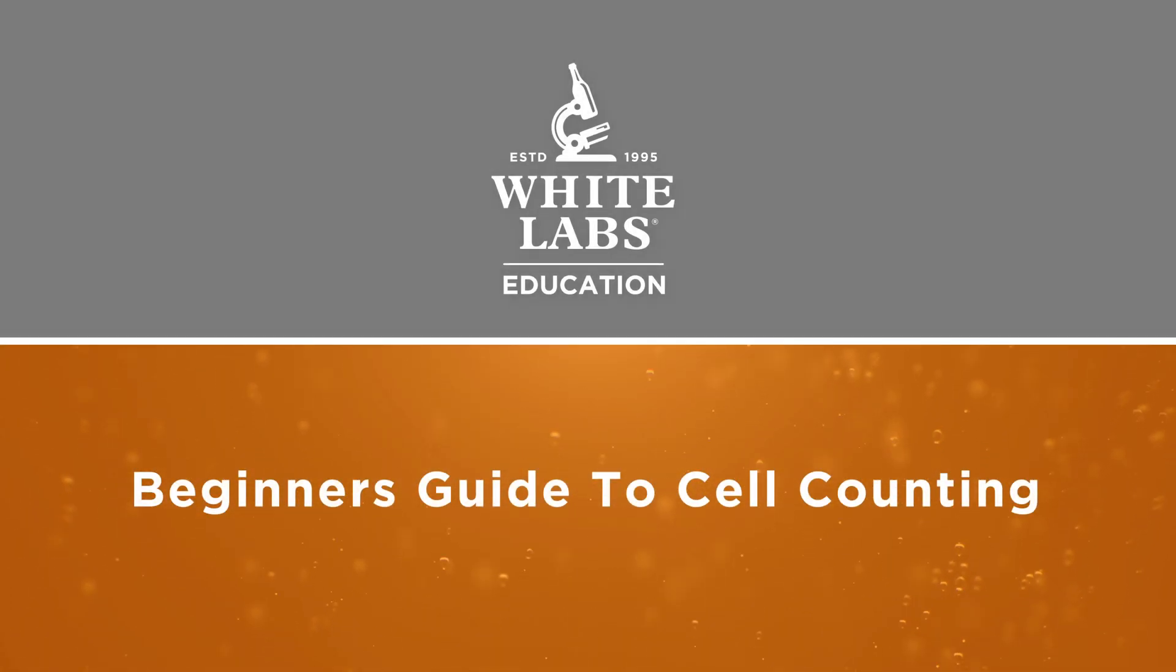Welcome to our beginner's guide to cell counting. This procedure includes techniques and affordable, easy-to-use materials ideal for those looking to learn cell counting.